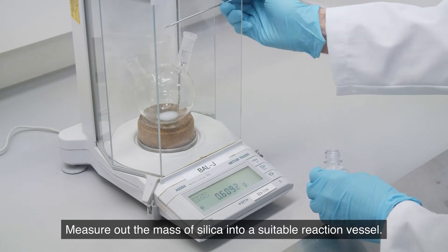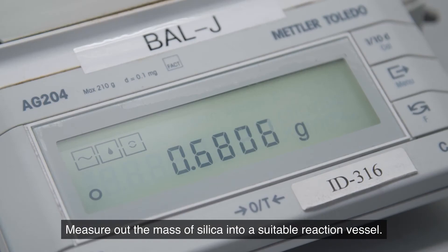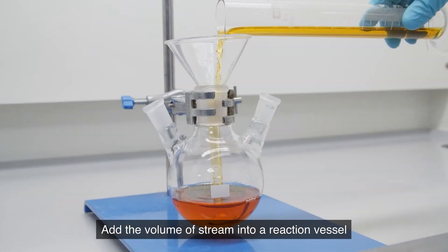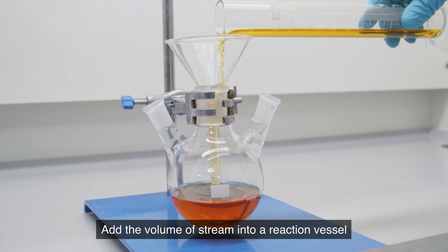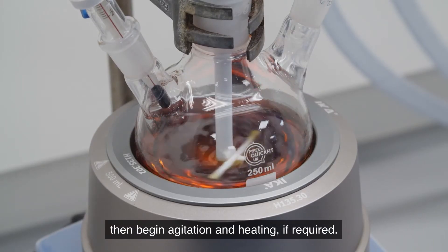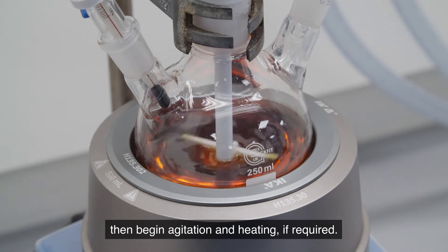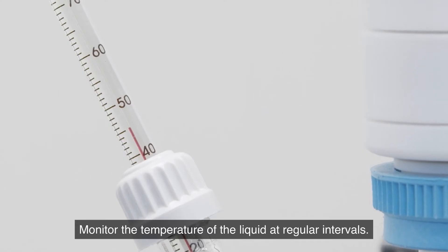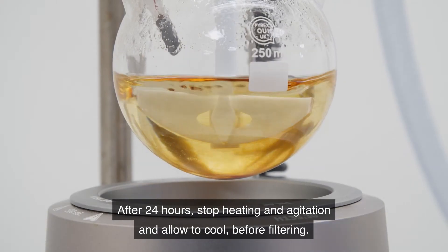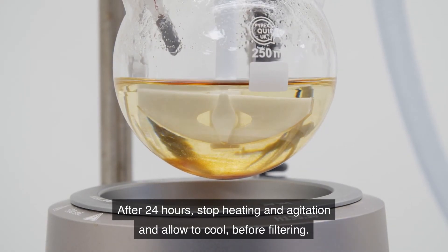Measure out the mass of silica into a suitable reaction vessel. Add the volume of stream into the reaction vessel and then begin agitation and heating if required. Monitor the temperature of the liquid at regular intervals. After 24 hours stop heating and agitation and allow to cool before filtering.